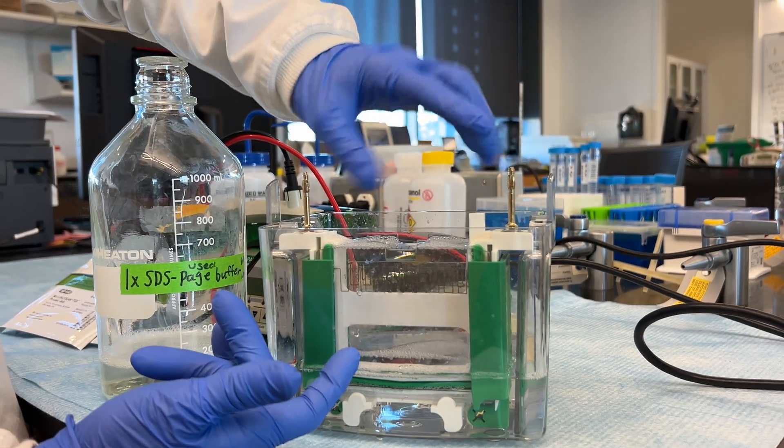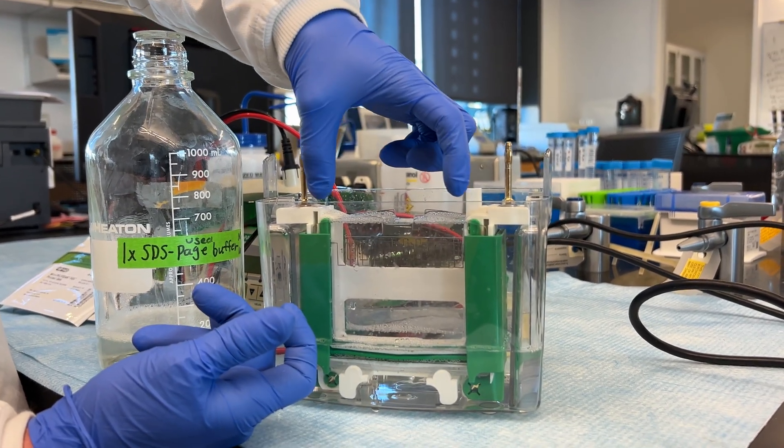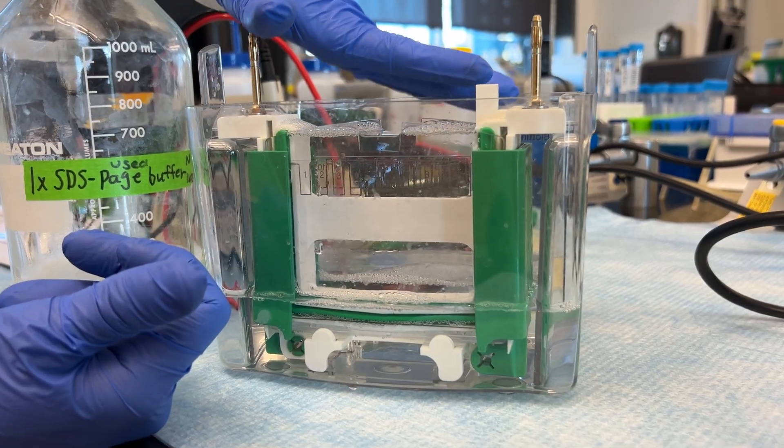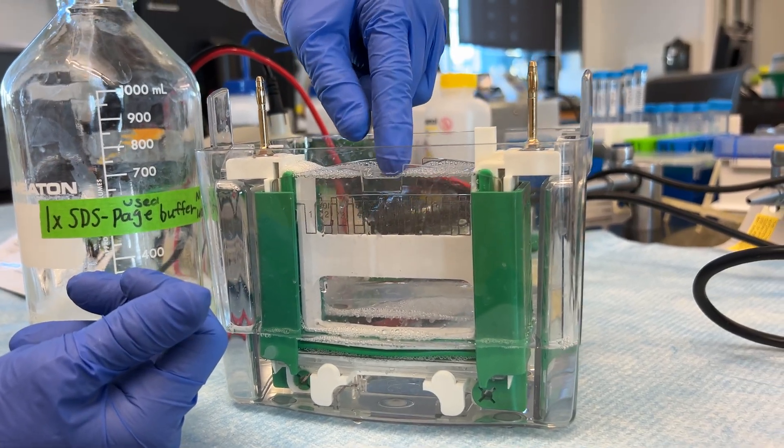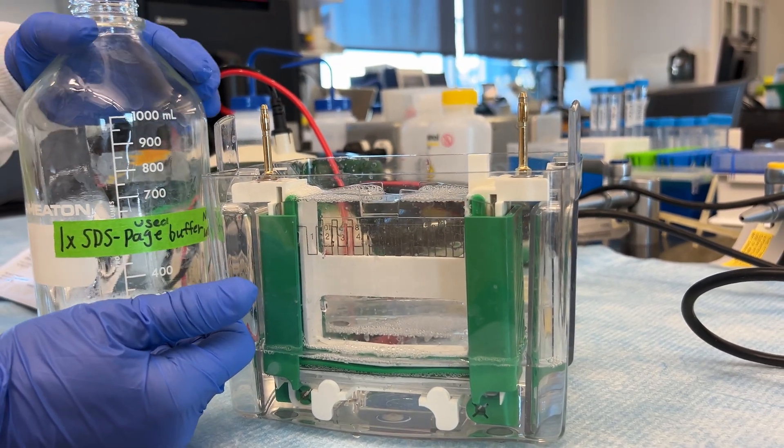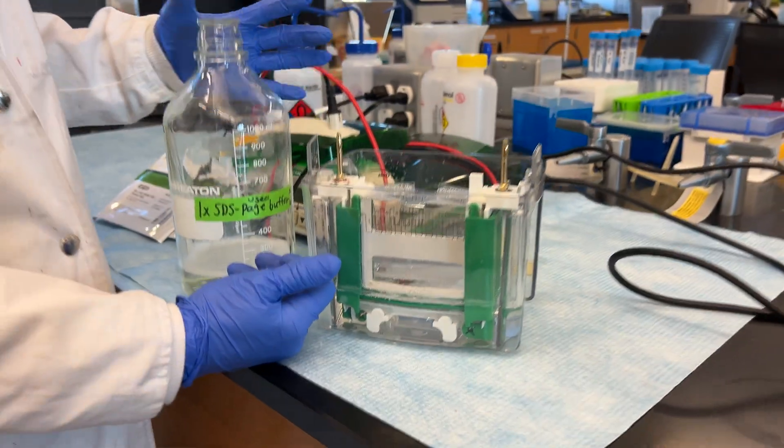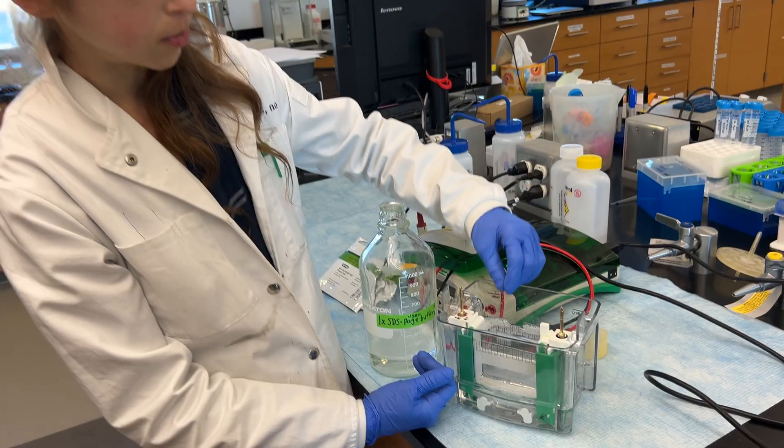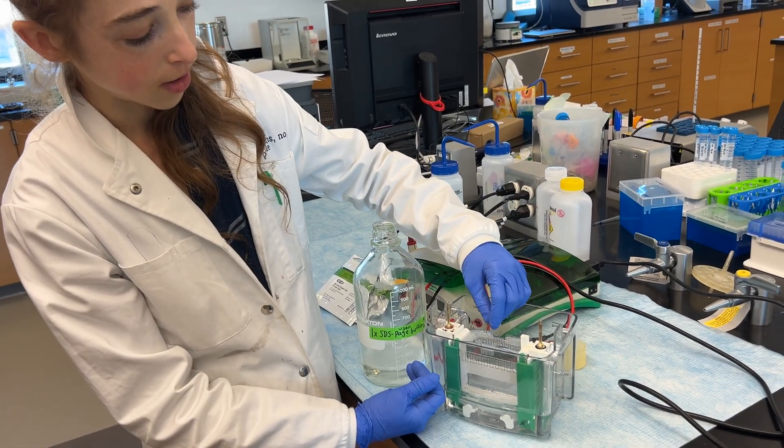And then that's why it's really important that this inner cassette is sealed, because even if you have the same buffer in and out, if this leaks down, then the run is not going to work. You can salvage it if it's running partway and you realize it's leaking. You can pause the run and pour more buffer on the top.